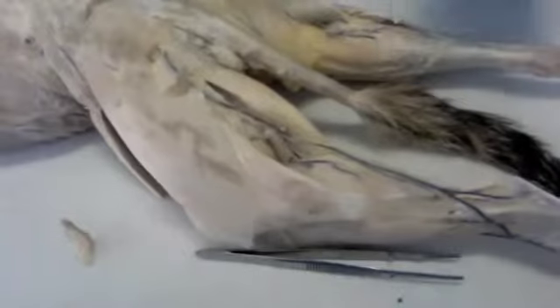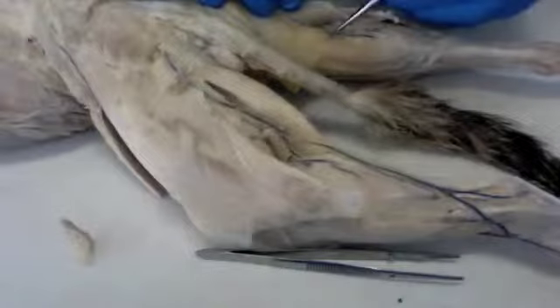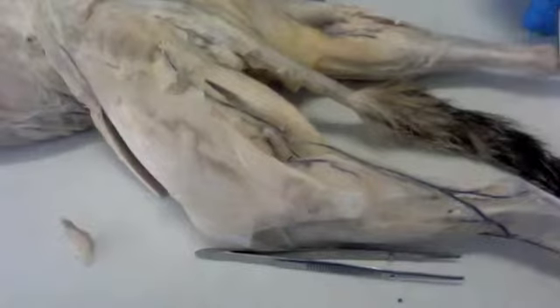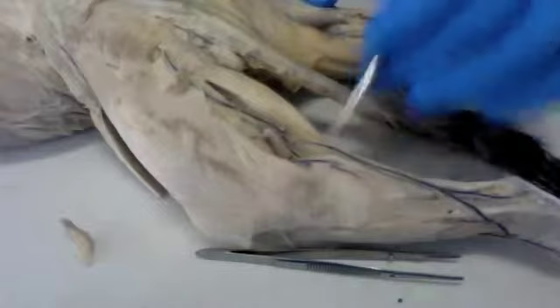Okay, start off here. We have the popliteal artery, and I'm only going to be able to demonstrate the left popliteal and the left posterior tibial artery, because the right side is too damaged.